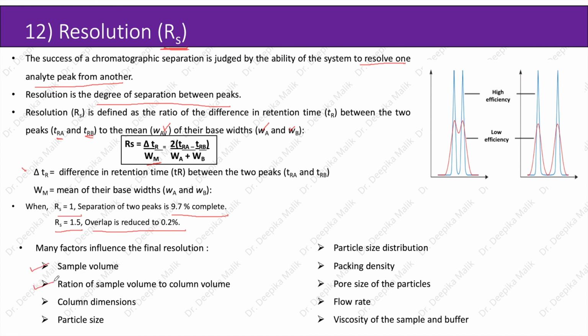of sample volume to the column dimensions, particle size of stationary phase, particle size distribution of the analyte between the two phases, packing density, pore size of the particles, flow rate and viscosity of the sample and buffer used. So till now we have discussed and established our base for the understanding of column chromatography working.